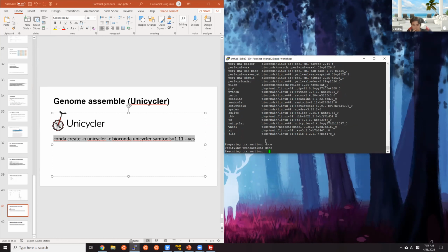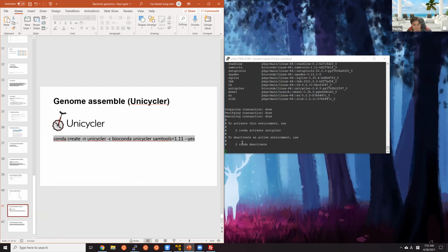Let's wait a few moments here. Okay, so once it's installed, you can activate it.